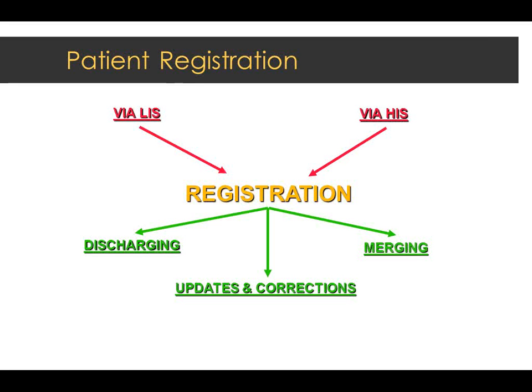Then we sometimes got into the process of a John Doe coming in. We just had one of these a couple of weeks ago. Came in within hours. They figured out his name, re-registered the patient, and now we've got a blood bank, and everything is all messed up because they've got orders under John Doe, and now it's really Tim Hamill, and we hadn't merged those two.